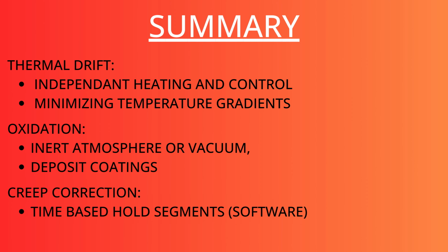Last but not least, we will have creep. Well, how can we work our way around that? We will use time-based hold segments, and from those we can extract creep components as well as the plastic and elastic components. This is done by software.